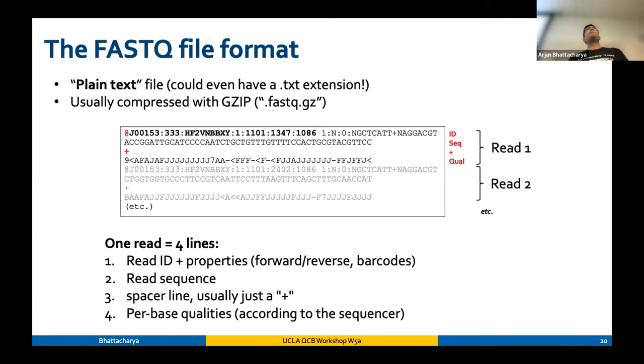There's a lot of cost-benefit here. When you're designing an experiment like this, there's the money that you have. Say you have a fixed sample size. Then you have to think about whether to sequence all the samples and maximize read length or coverage, or maximize coverage and sequence a certain amount. There's a trade-off here, and it's not a linear trade-off. For differential expression analysis, there are papers that do that cost-benefit analysis for you. If you're interested in things like what I do, linking genetics to expression, there's another cost function you can think of.